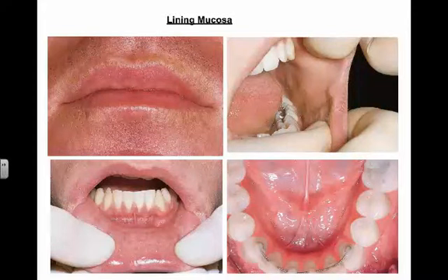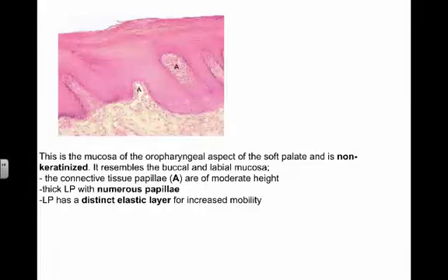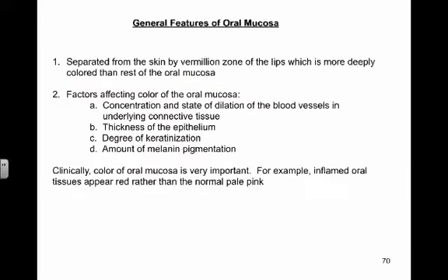I just want to show you lining, get that there. Okay, the papilla. Okay, here. Specialized. Okay, just as a reminder.